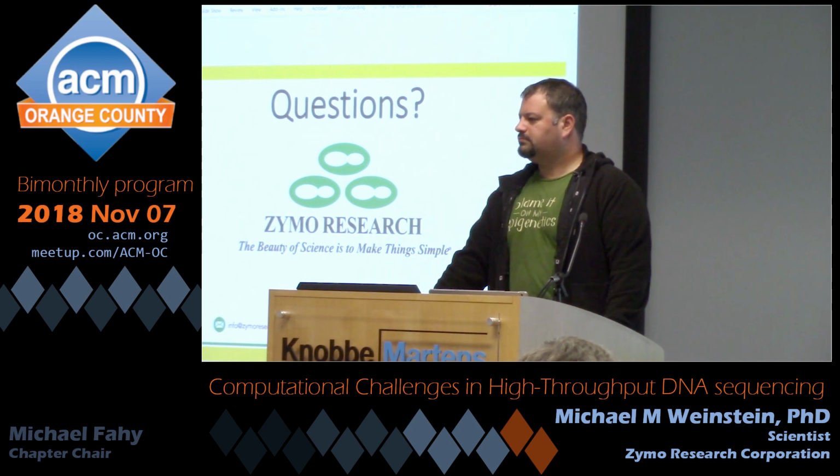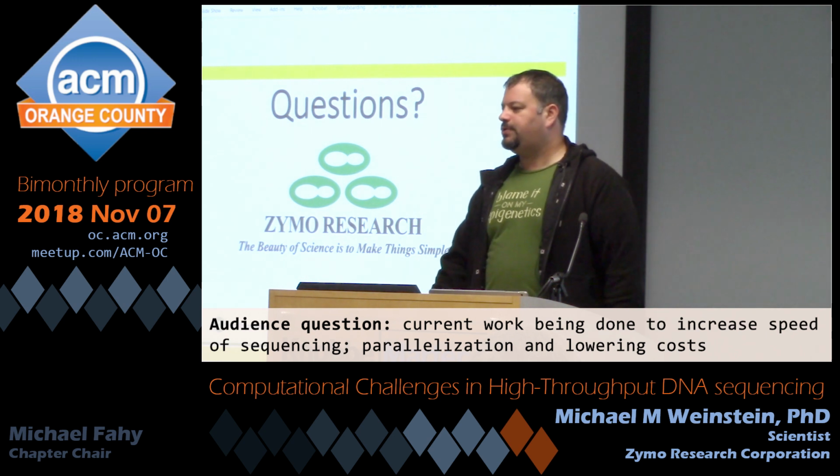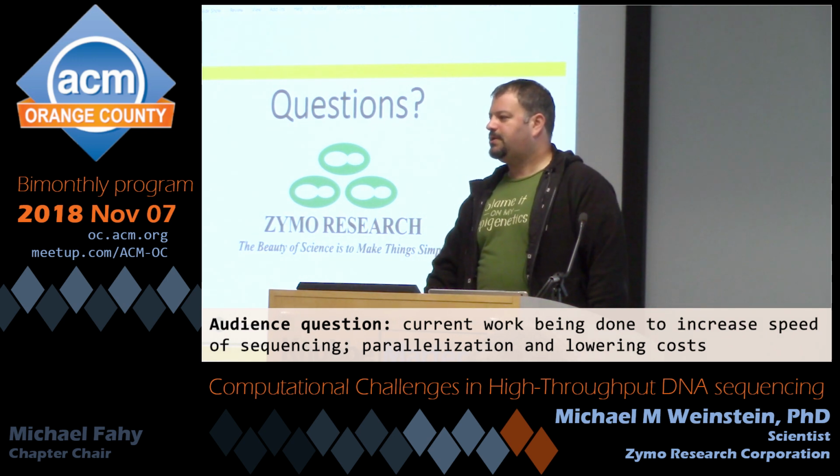What's happening on that aspect of it? My assumption is there's a lot of cost that goes into that aspect. There's a fair amount of cost, not as much as you'd think, because that very expensive process I mentioned, assembling a genome, that's kind of a front-end load. So you're going to do that when you make the reference genome, but once you've made the reference genome, it doesn't have to be done again.